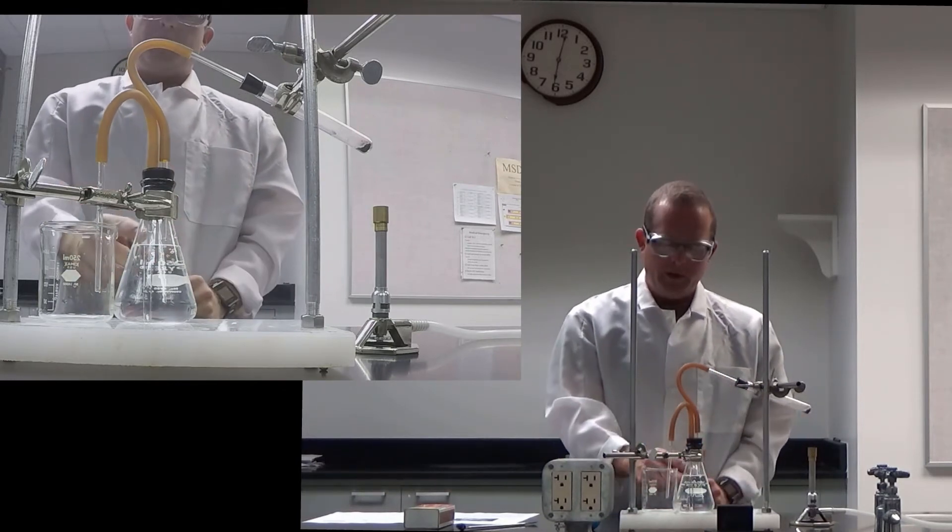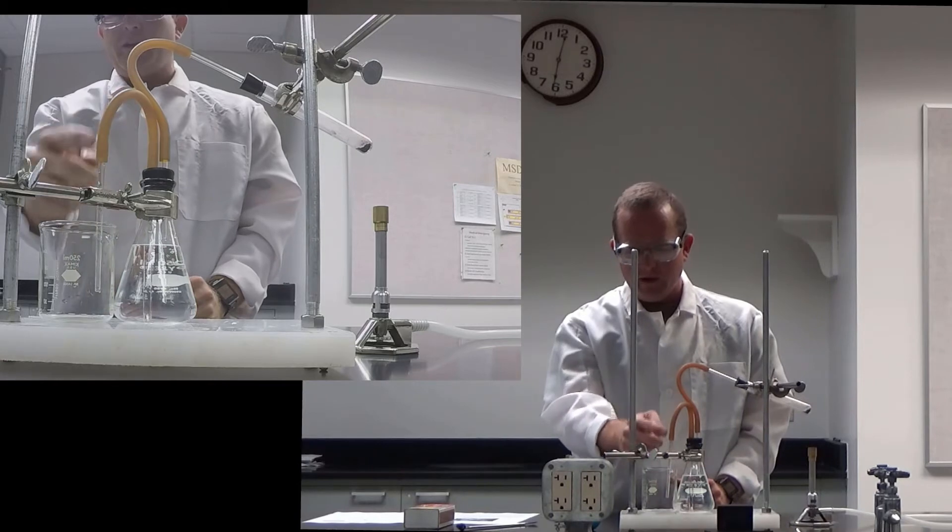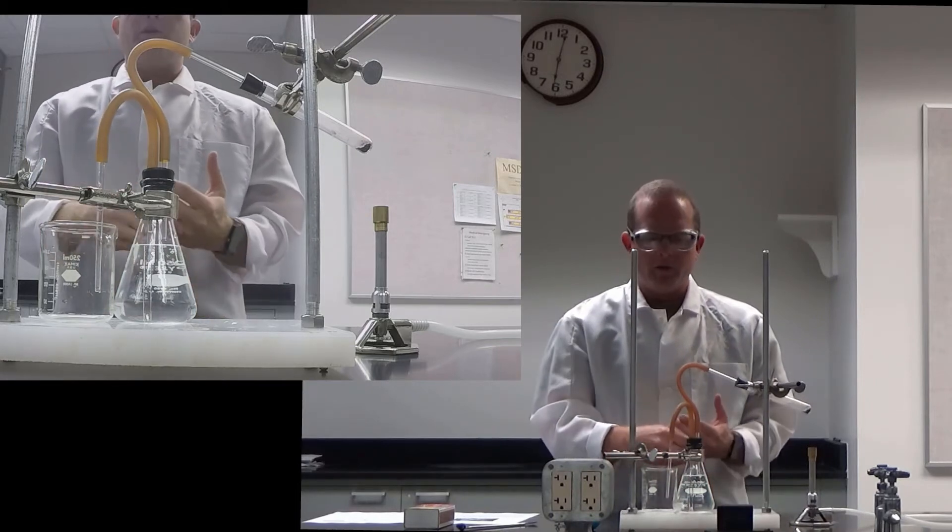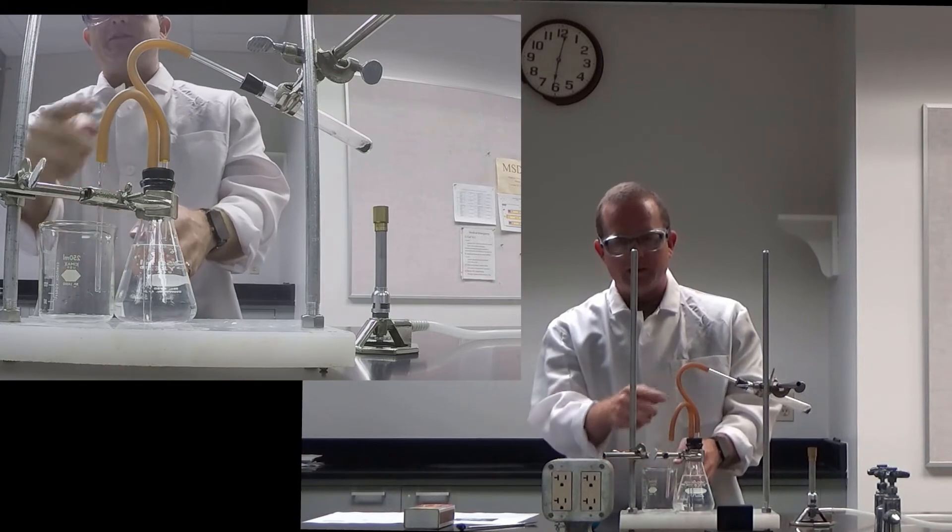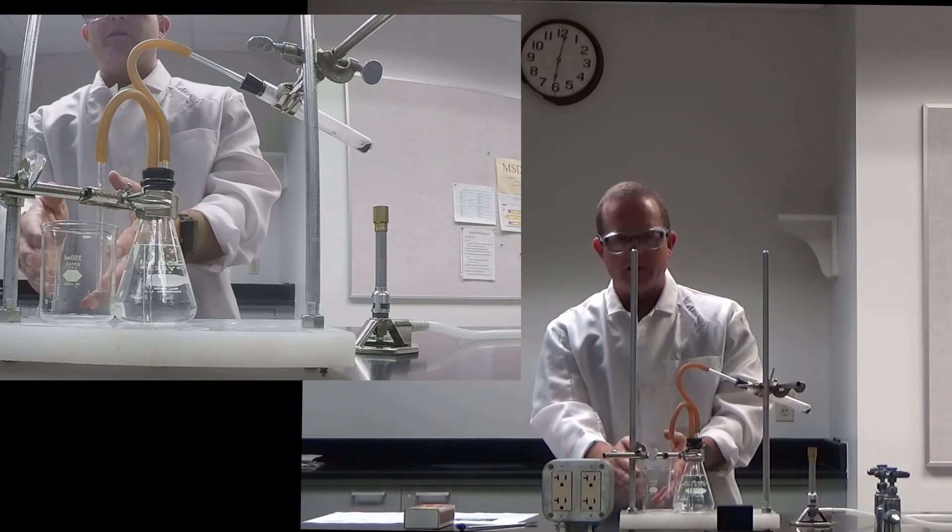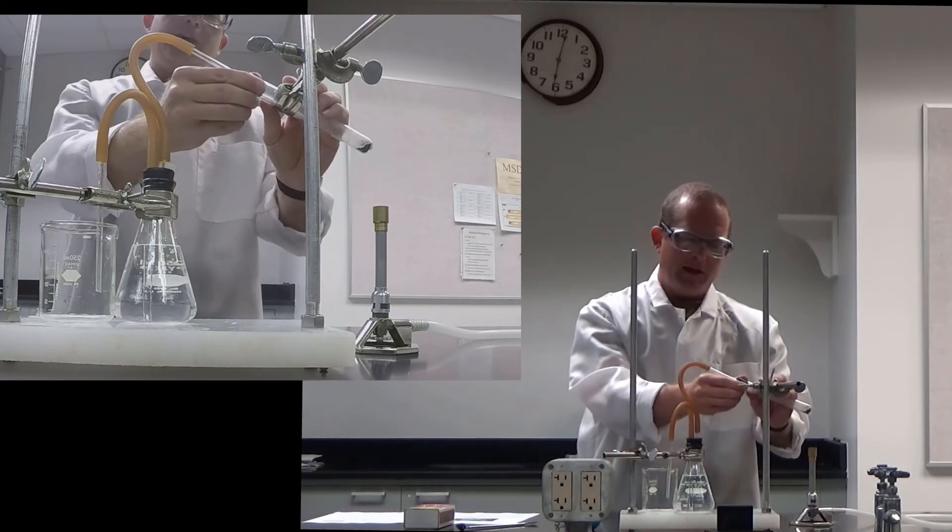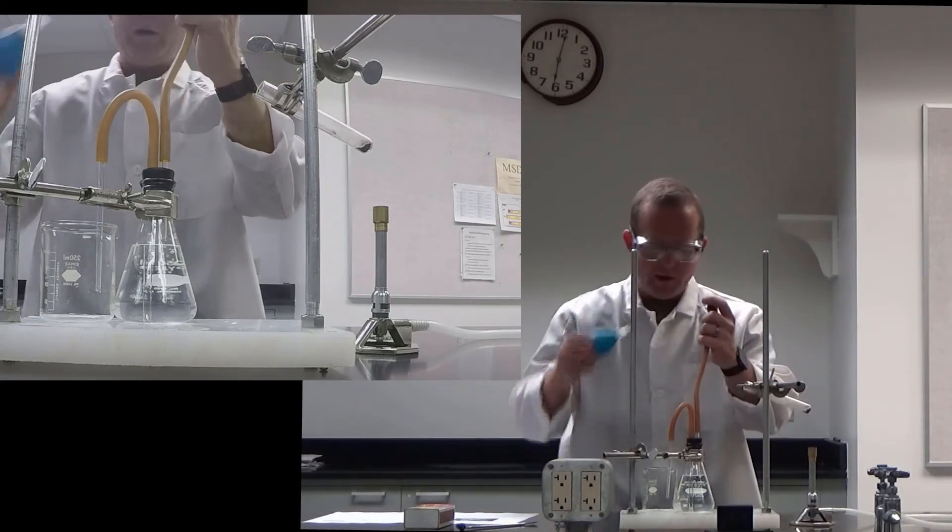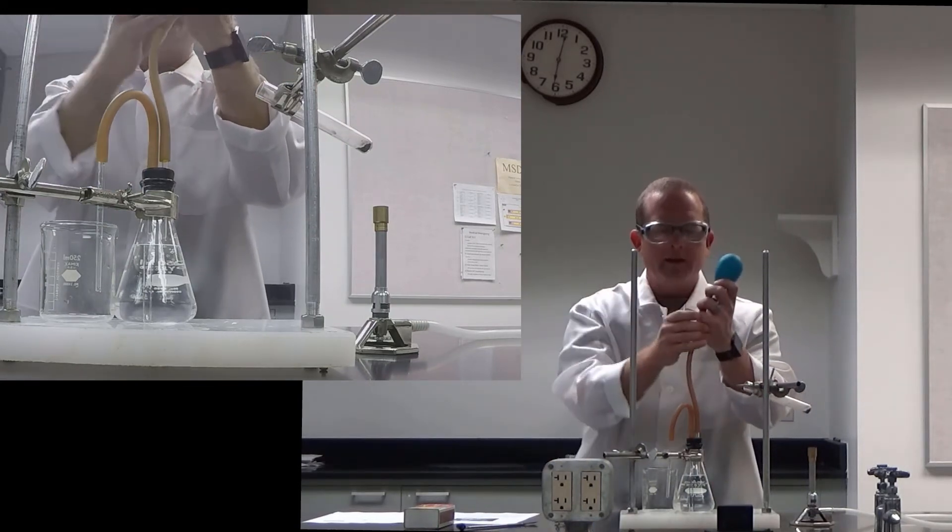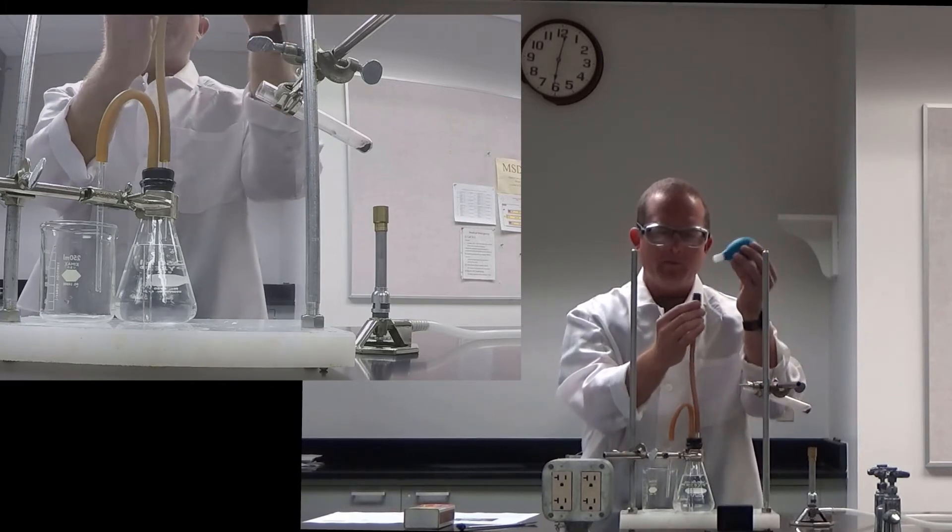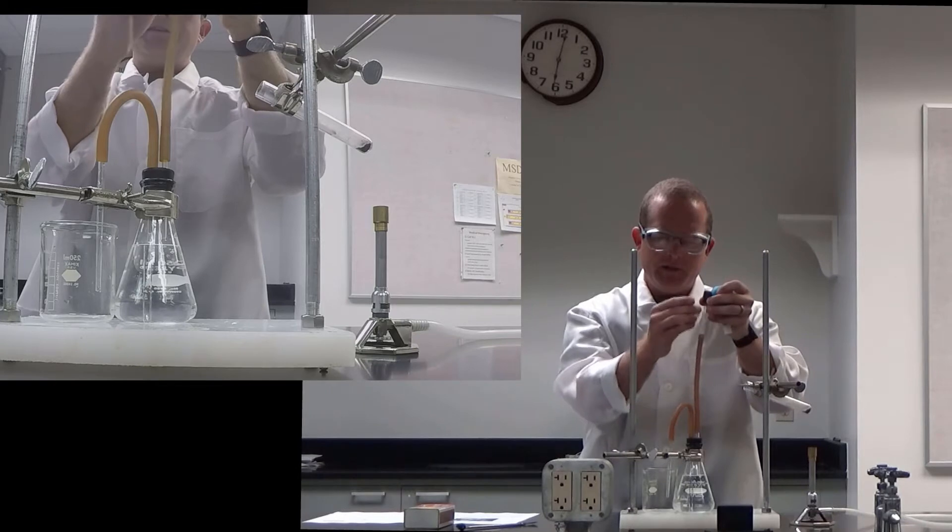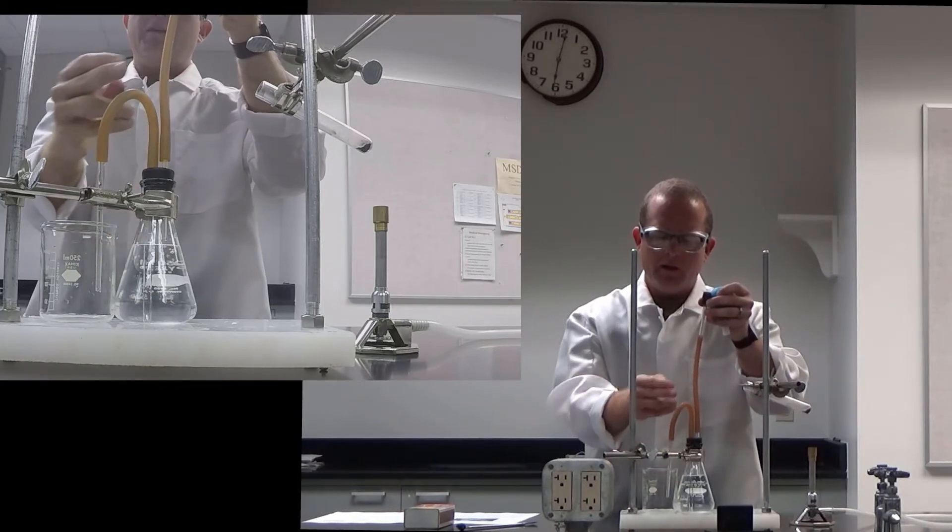But before we start with this, we need to make sure that this tube here is full of water so that we don't account for the air that's in that tube when we're measuring the mass of the water at the end. So to do that, we need to charge that tube with water. So this can be kind of tricky. You can use a partner when you do this, but you want to take a pipette bulb and you want to push air into this tube and force water into this tube.